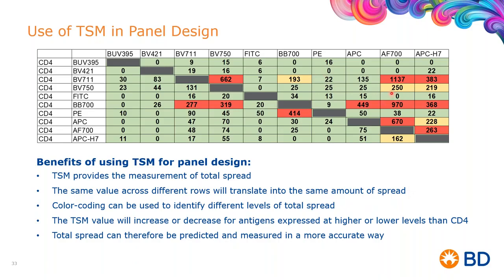So you actually can use this tool to see where the problems are and start from there and say, okay, these two are a problem. Let me put them on two markers on two different lineages. And you solve the problem right there. So the short answer is there's not really a maximum acceptable value. We can work with any value. It becomes a little bit more challenging because we need to accommodate for that change.